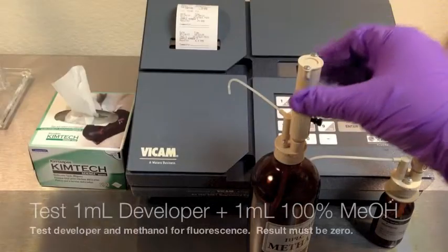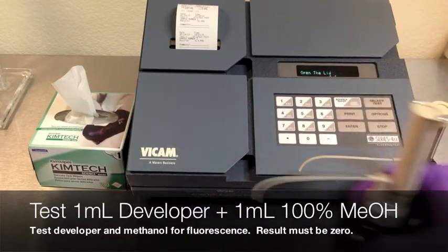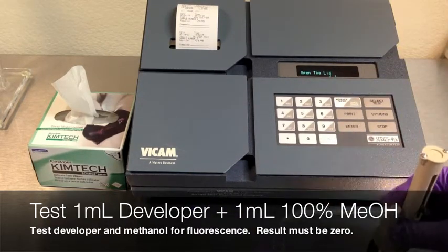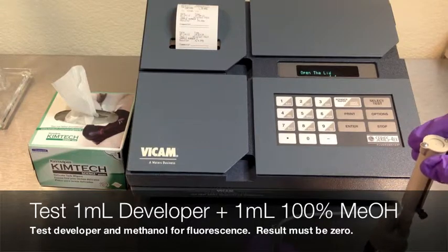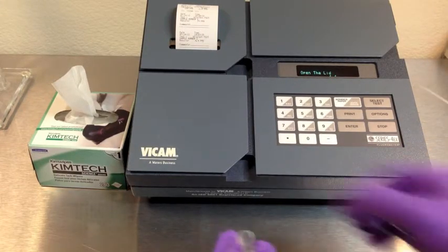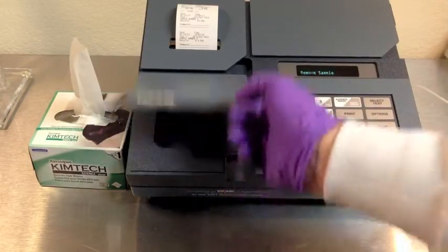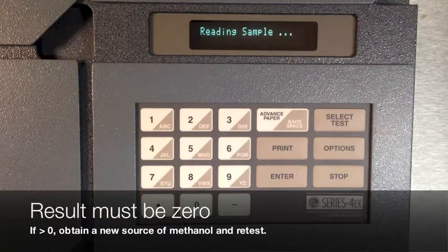Test the developer for fluorescence. Dose one milliliter of developer with one milliliter of 100% methanol into a clean cuvette. Wipe with a kim wipe and then insert into the machine. You'll get results after 60 seconds. This number must be zero. If not, obtain a new source of methanol and retest.